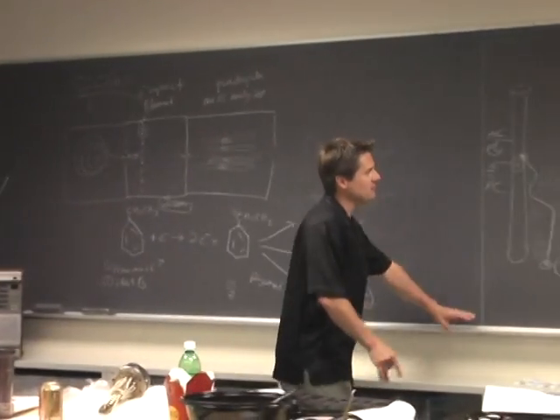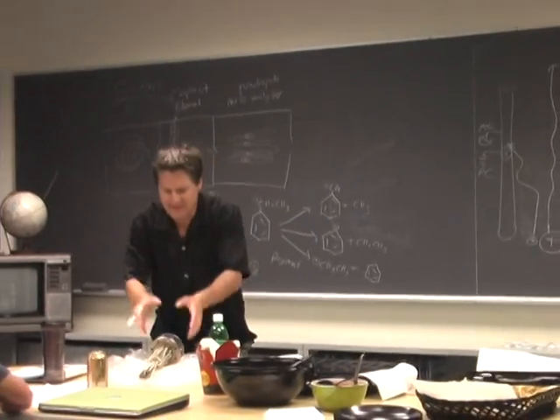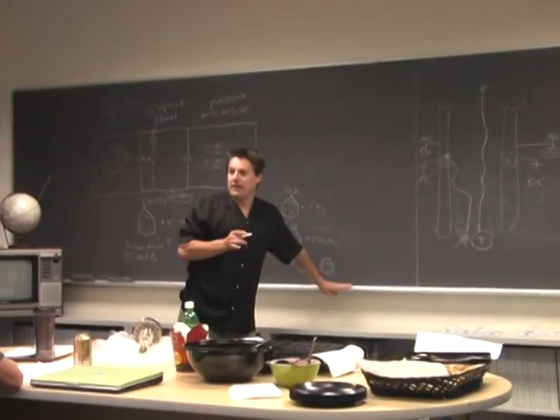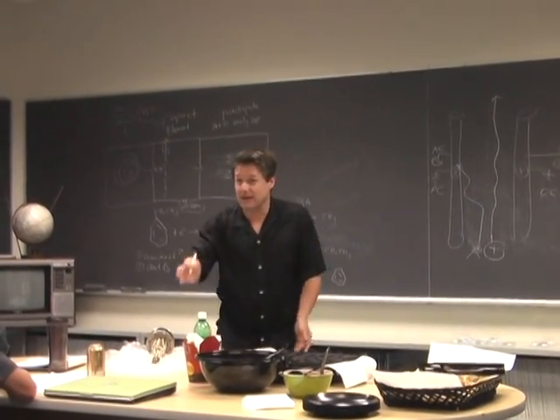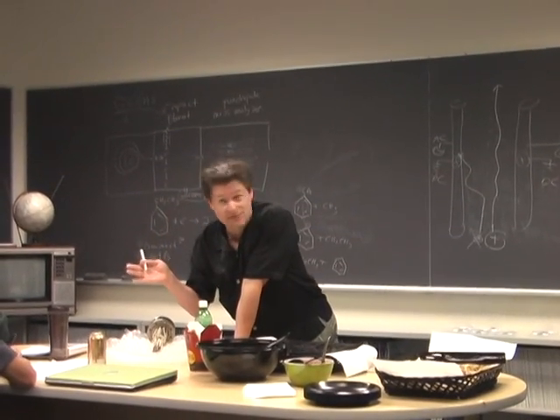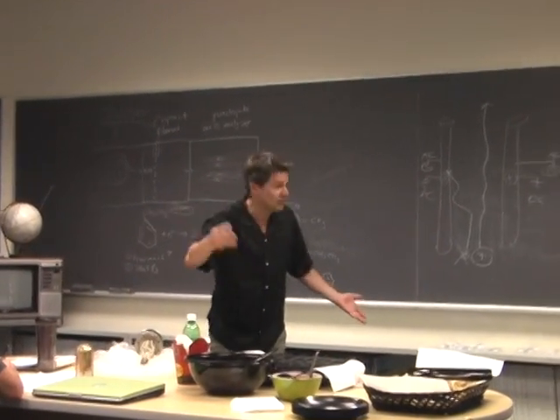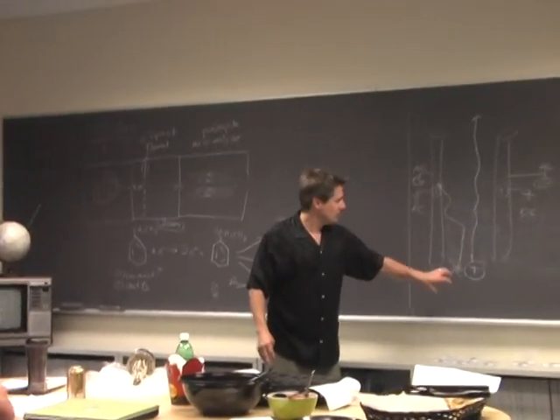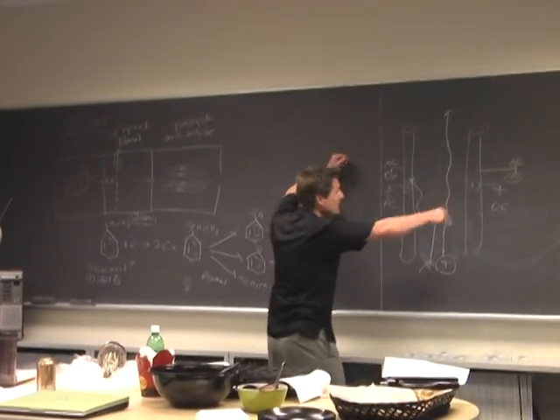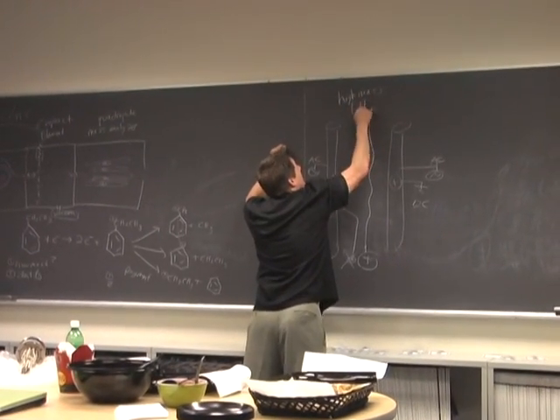So what we effectively have done is with the AC current and the DC current, and they have ratios. I think it's a 6-to-1 ratio, but they maximize the ratios to give you the best resolution possible. The small ions get wiped out. There's a mass, based on the voltages that we pick, there's a certain mass to charge ratio where nothing below that gets through. Everything above that gets through. Pretty basic. On two basic principles that you teach in middle school. Electrostatic repulsion and attraction, and big things don't turn as readily as small things. Very basic concepts.